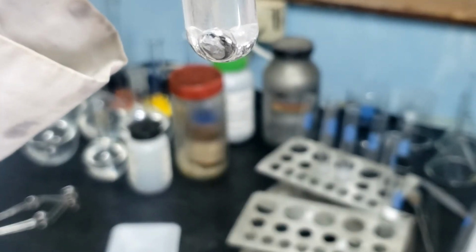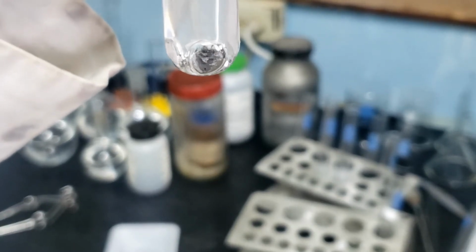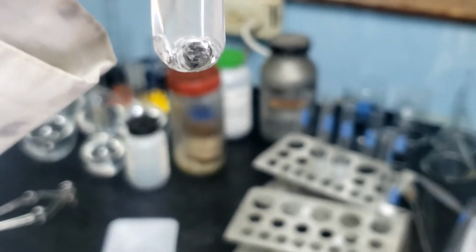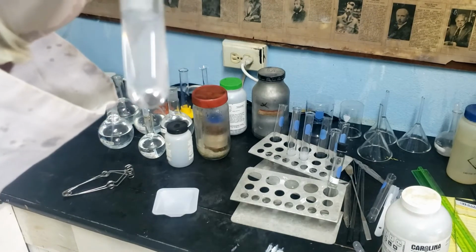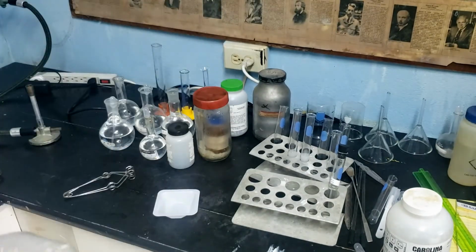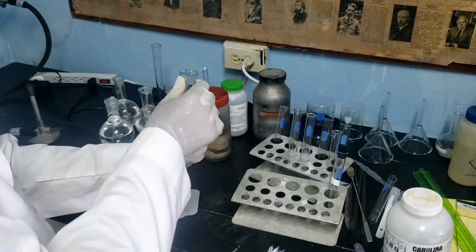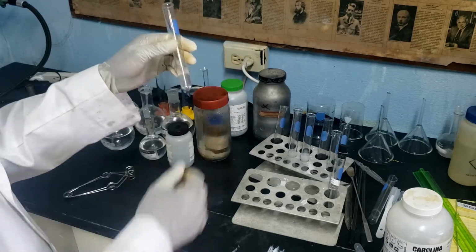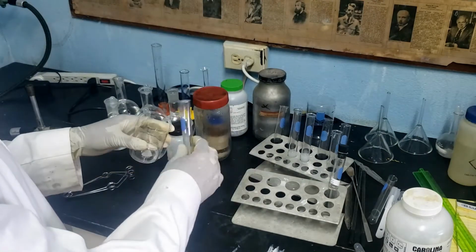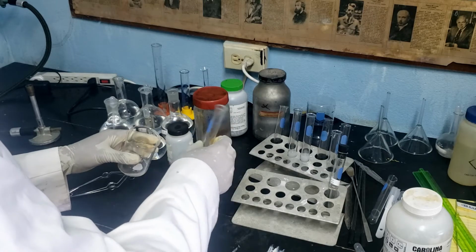The amalgamation reaction is a repeated cyclic process where metallic mercury is being produced and the aluminum metal is being eaten away, producing more aluminum hydroxide. The reaction is highly exothermic, and aluminum reacting with mercury can be very dangerous. This is why mercury is not allowed on planes.